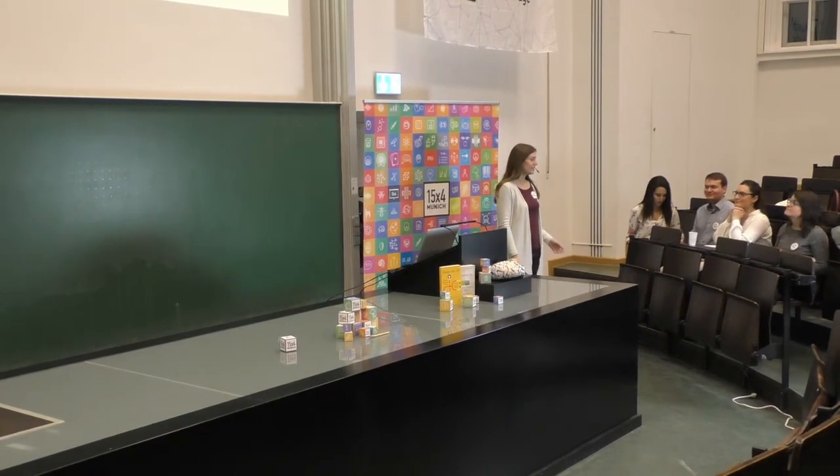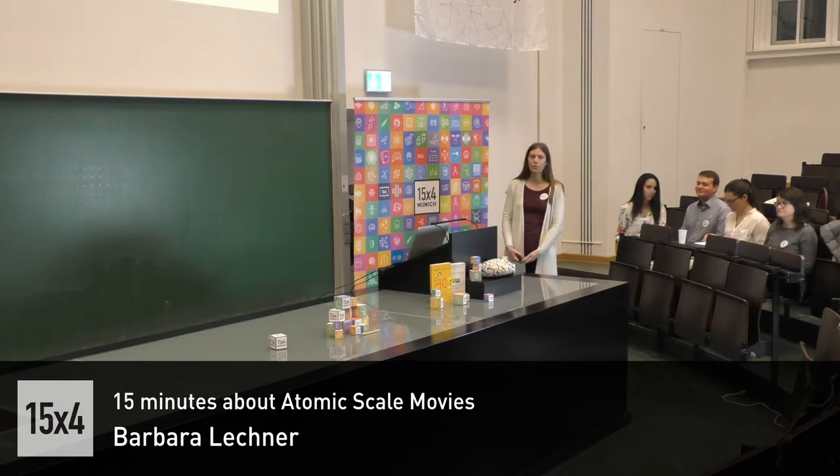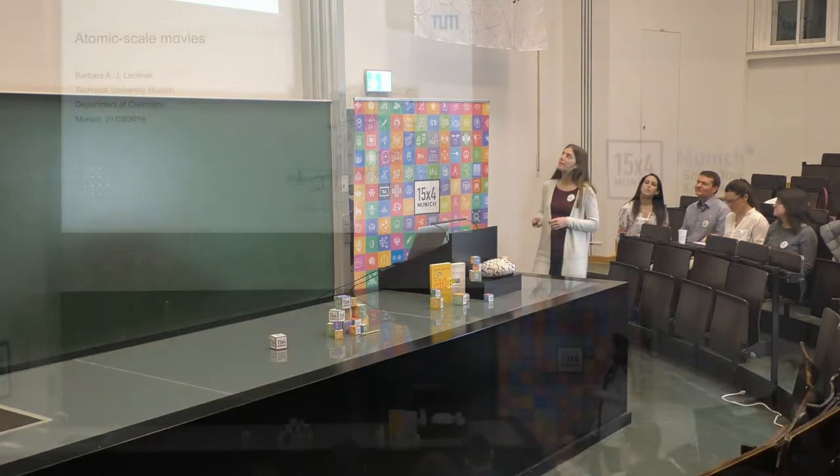So, like was said, I'm Barbara Lechner. I'm here at the TU Munich, a researcher on the molecular fellowship, and I want to show you today how we can record movies on the atomic scale.